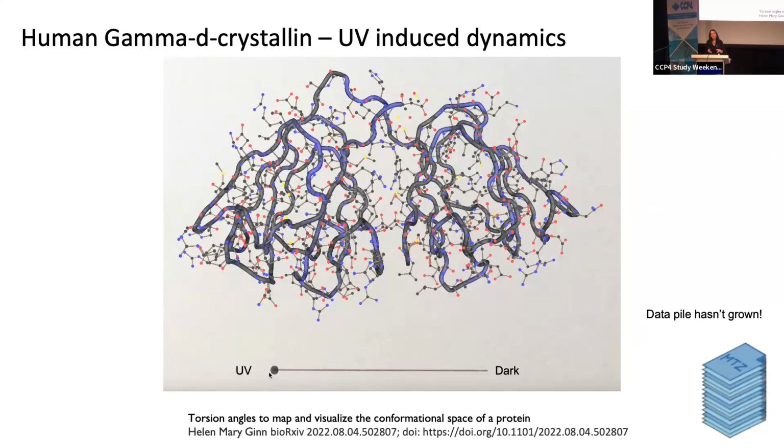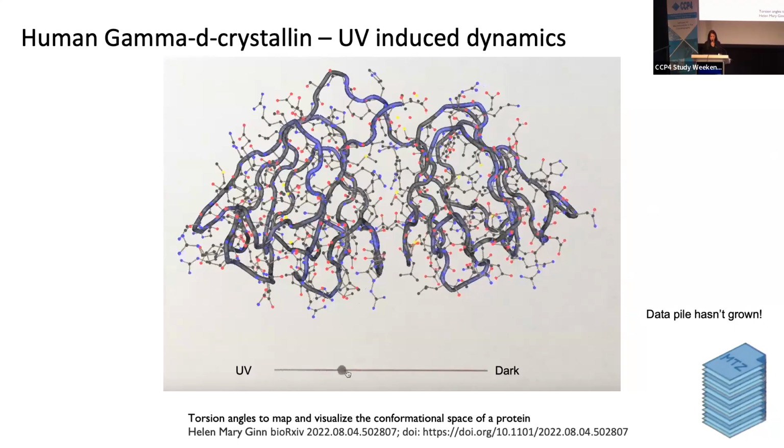So now I'm convinced that there is something interesting happening. I'm doing lots of time-resolved experiments. I'm doing lots of spectroscopy. My data mountain is growing uncontrollable once more. But hopefully by using these different tools and applying them to the problem, we are able to start making use of all of this characterization data that we collect whilst we're developing new methods.